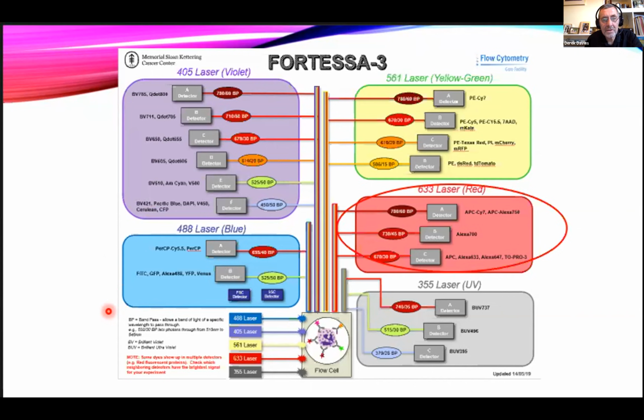So that works out as 18 fluorescence detection channels and 2 scatter parameters. So that's quite a sophisticated cytometer. And in fact, that's the limit of the BD LSR range. So whether it's an LSR2, a Fortessa, or an X20, 20 parameters is the most we can do. So this is quite a big one.